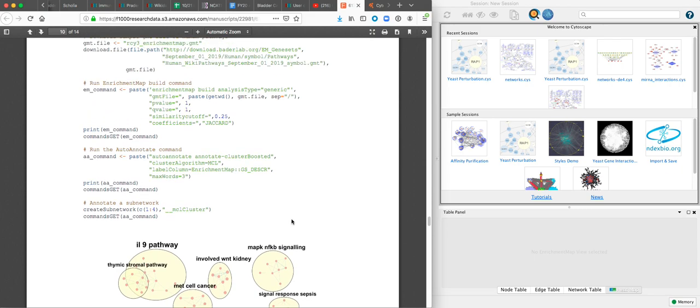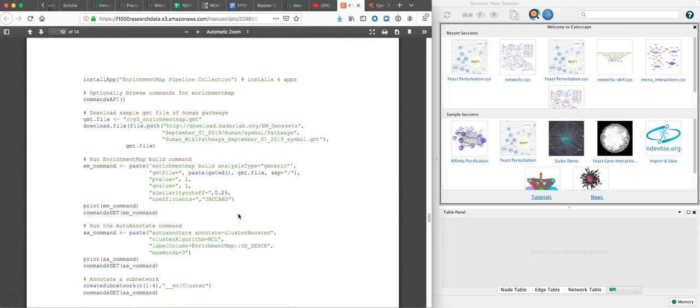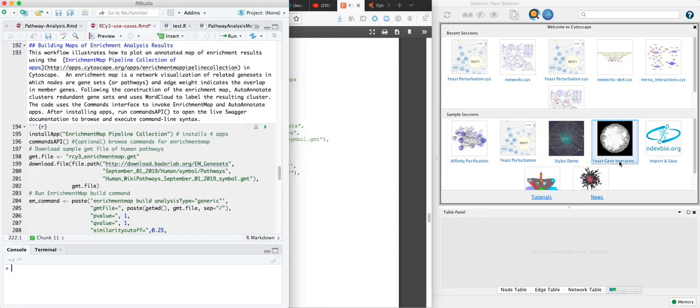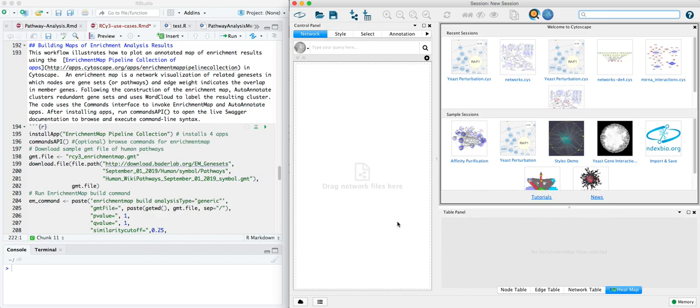The code in this use case is available as an RMD, link to below, and so we'll open that up in RStudio and run it live here in a local instance of Cytoscape.